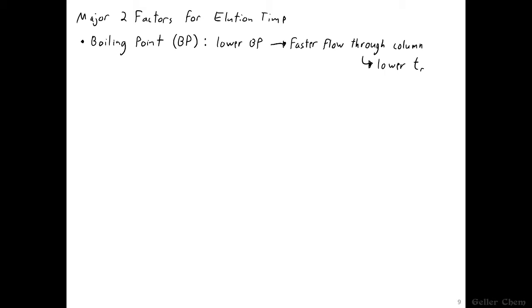Now, the other major factor that we will consider is polarity. When I say polarity, I'm talking about both the solute and the stationary phase.